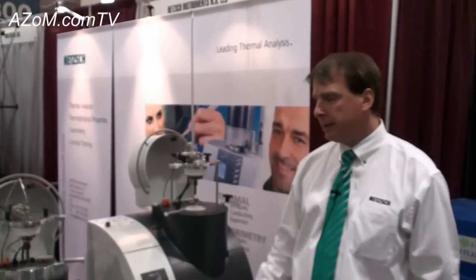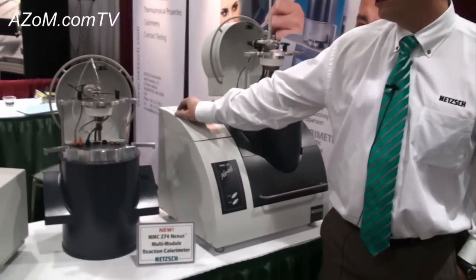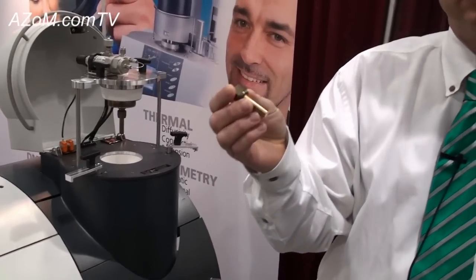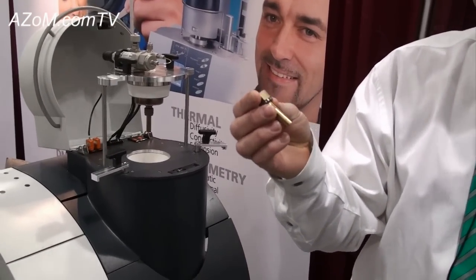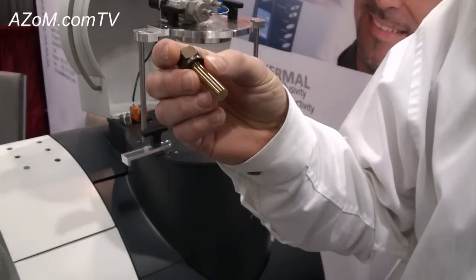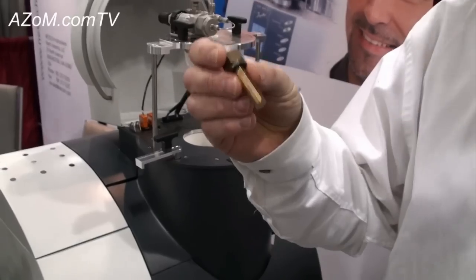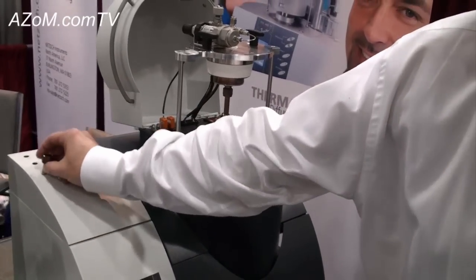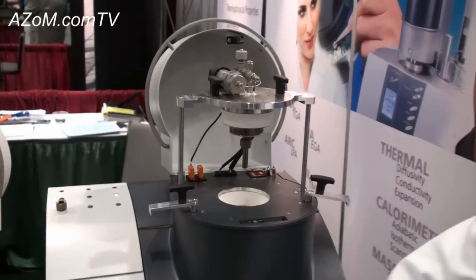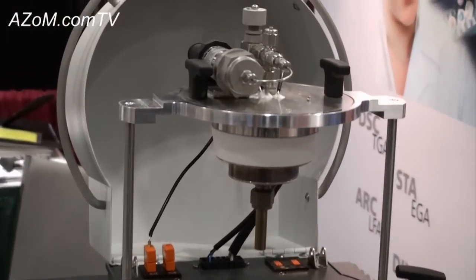This is a new calorimeter we've designed that's a very convenient size for benchtop calorimetry measurements on mostly liquids, but also solid samples and some battery materials. A typical sample size would be anywhere from 100 microliters up to maybe one or two milliliters. We have different modules that can be interchanged, so we have a base unit and then we can swap modules depending on the application and the measurement we want to make.